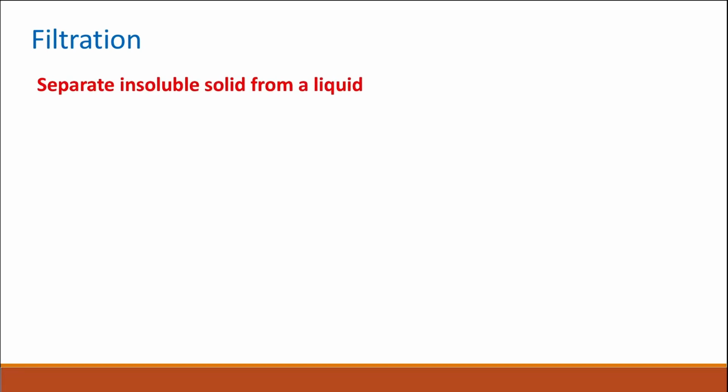Filtration is one of the physical processes that is used to separate the components of a mixture. Filtration is specifically used to separate an insoluble solid from a liquid.